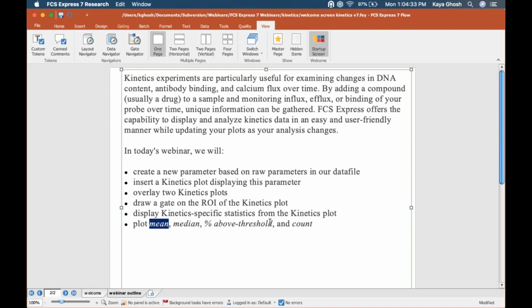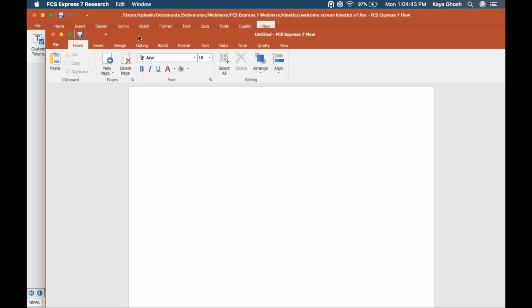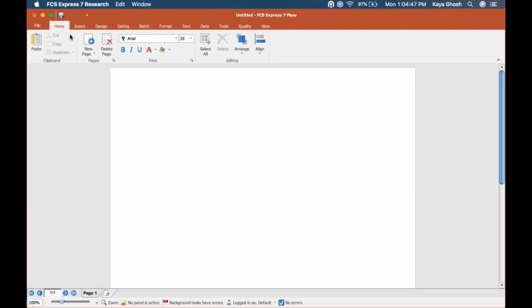Okay, so let's get started. I'm going to start with a new layout. This is not going to be a very long webinar, so even though I'm starting with a new layout, I think you'll be able to get an overview of how to work with kinetics data in a relatively short time. Okay, so here's our new layout.